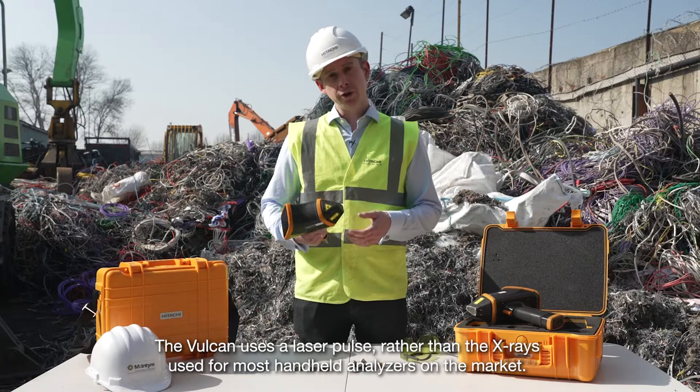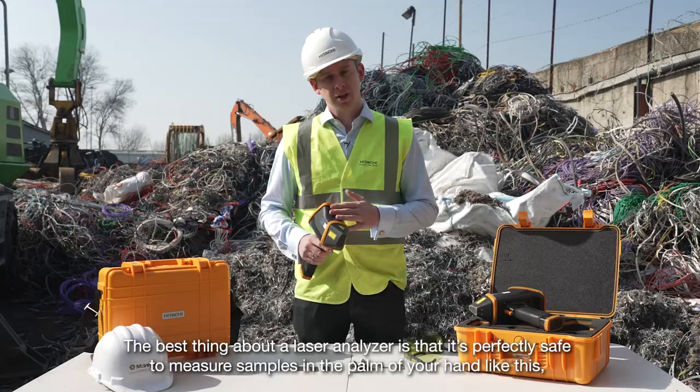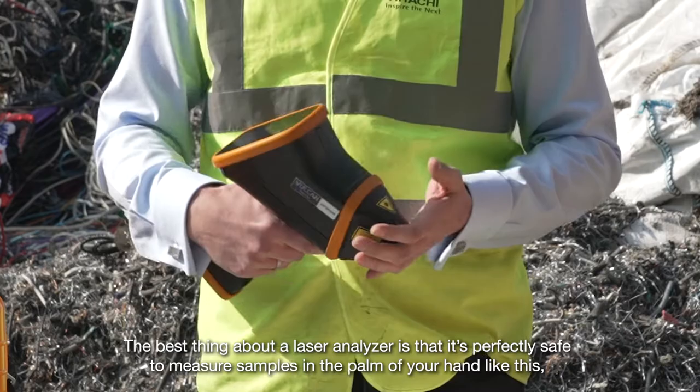The Vulcan uses a laser pulse rather than the x-rays used for most handheld analyzers on the market. This means in most countries that it doesn't need registering and it's ready to go straight out the box. The best thing about a laser analyzer is it's perfectly safe to measure samples in the palm of your hand like this.